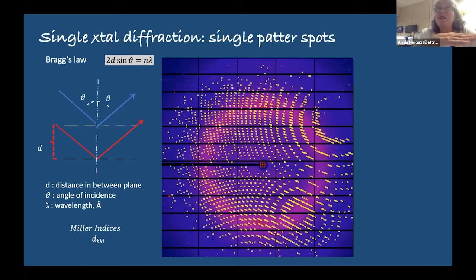It's basically the X-rays going through your sample. Most of it will just go through and hit nothing. So we block the direct beam, which is absolutely, you're talking about 99% of the beam going through. And the 1% that will be diffracting is what you are actually seeing here in the pattern. If you're not a crystallographer, maybe not, but for me this looks good, I know immediately that I have a good crystal.